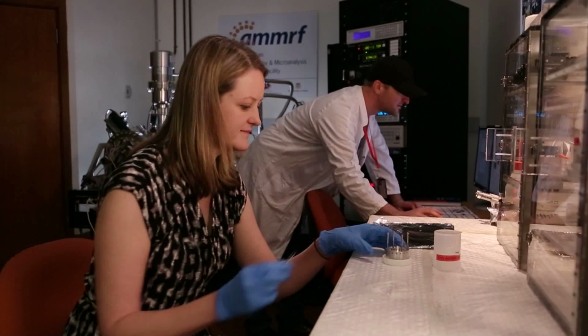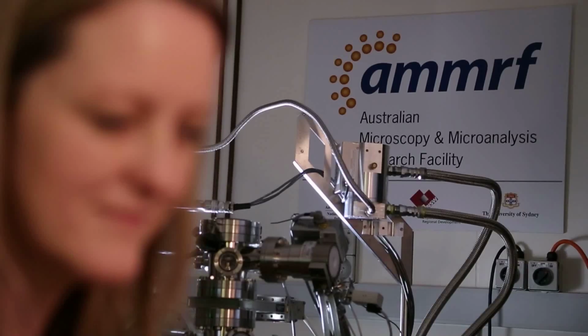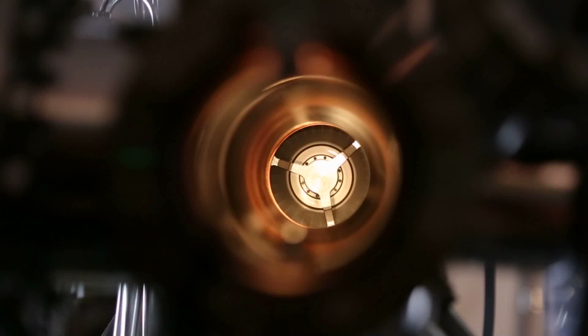The University of Sydney is a really excellent place for me to be able to do my research because I have access to world-leading facilities that can allow me to do really detailed characterisation. My research really depends on being able to get very, very high quality new information and ask new questions through new characterisation techniques. Sydney is headquarters to the Australian Microscopy and Microanalysis Research Facility. This is a fantastic national facility with all kinds of electron microscopes, atom probes, and various other kinds of tools that let us take a journey into the inner space of materials and see how they work.